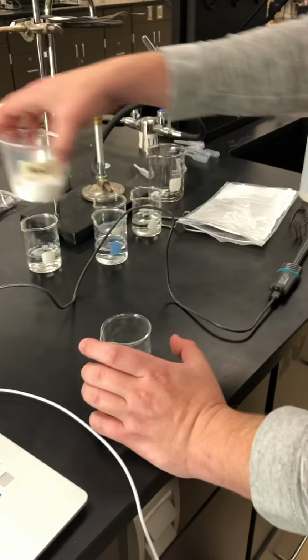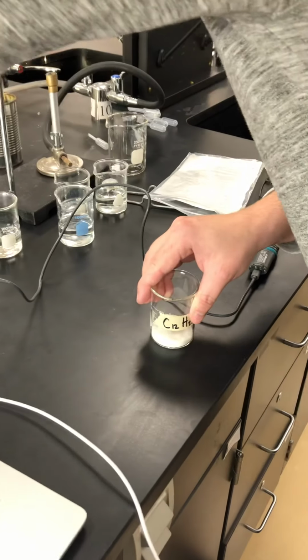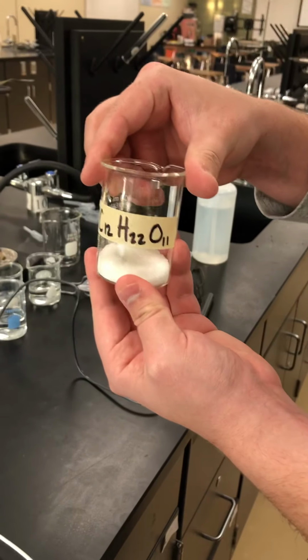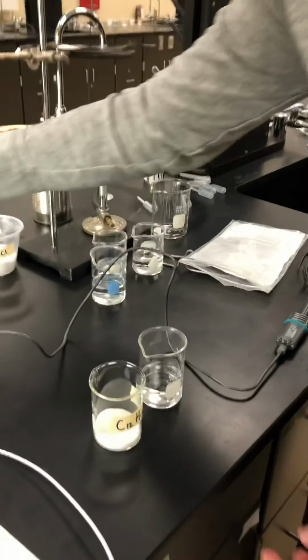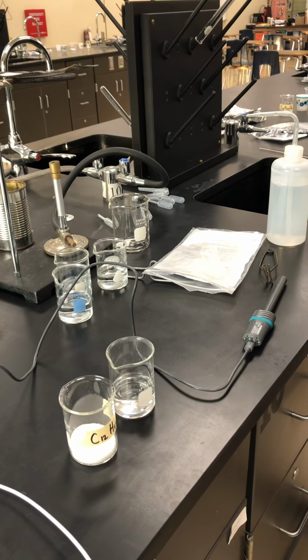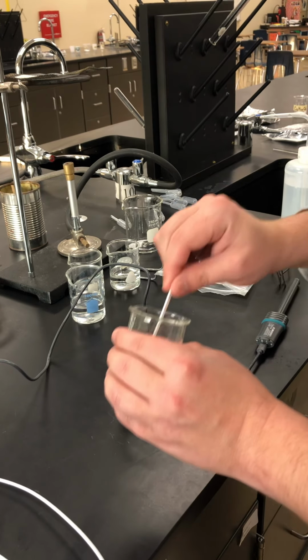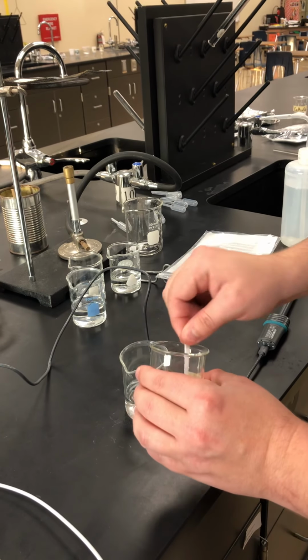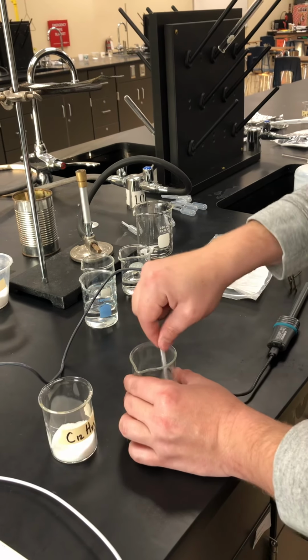Now we can move on to our next one, which is C12H22O11, which is table sugar. I'm going to use this one. Same thing here. 4 scoops of this. I'll give this one a little stir.